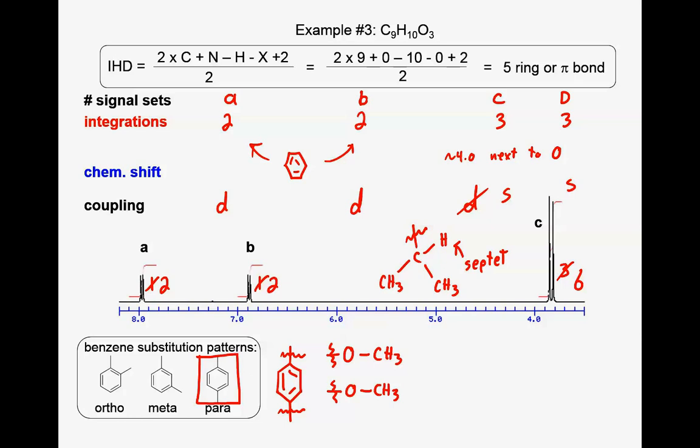But do these 2 peaks have the same chemical shift? No, they don't overlap. We see 2 discrete peaks, and so what that tells us is that these 2 things are definitely inequivalent. So somehow when we draw a final structure, these things can't be such that they are equivalent protons.